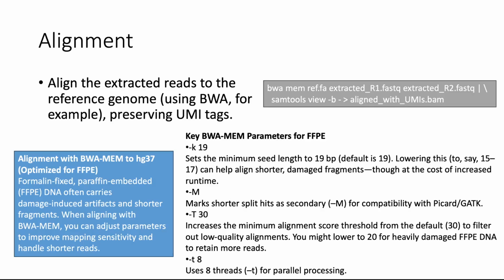For example, in the BWA-MEM tool, we can set up the minimal size of these fragments of DNA, and for example, we can correct it for shorter reads.